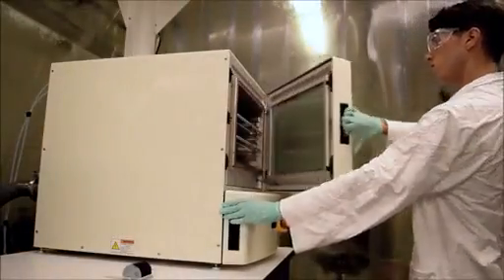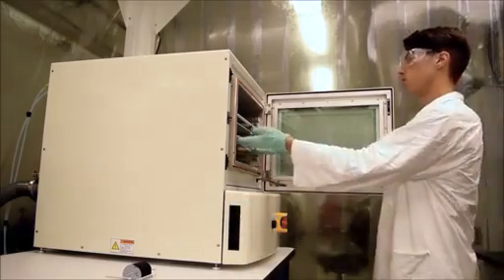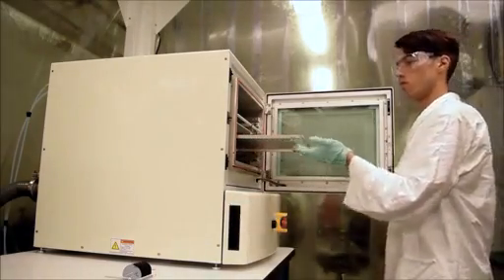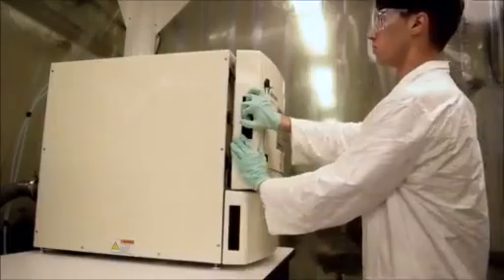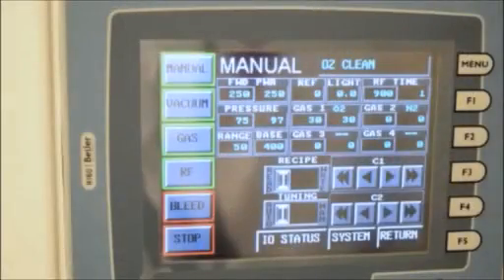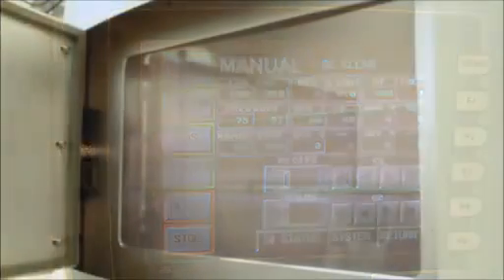Next, place the quartz carrier into the plasma system and initiate the vacuum. The system was configured for a 250-watt, 15-minute oxygen plasma clean with a flow rate of 30 SCCM of oxygen.